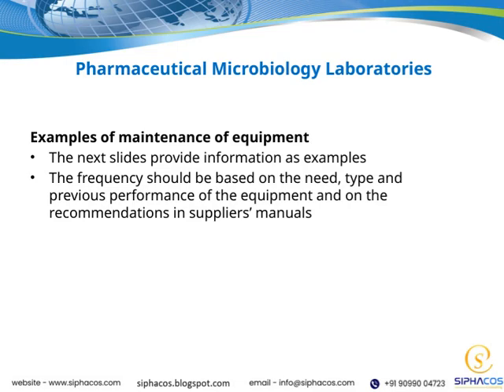The upcoming slides will provide specific cases to help illustrate these points. It's important to remember that the frequency of maintenance should be determined by the actual needs of the equipment, its type, and how it has performed previously. Additionally, always refer to the manufacturer's manuals for their specific recommendations.